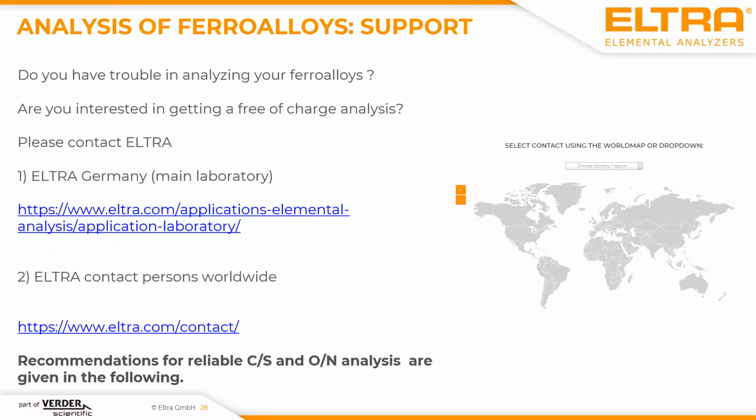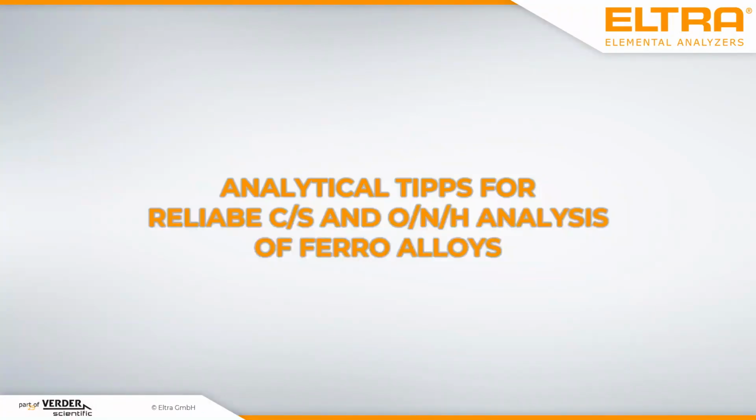And then it's a little bit easier to see how good and how reliable the Elementrac series would work for your kind of sample. The following slides are intended for those of you who maybe have some experience in analyzing ferroalloys. On the following slides, we will show you some tips and tricks which you have to consider when you process a lot of different ferroalloys, because different ferroalloys could mean that you have to consider the chemical matrix of the ferroalloy in more detail.